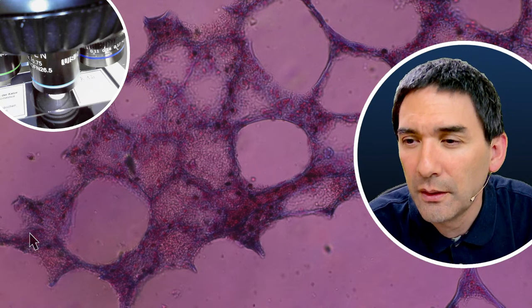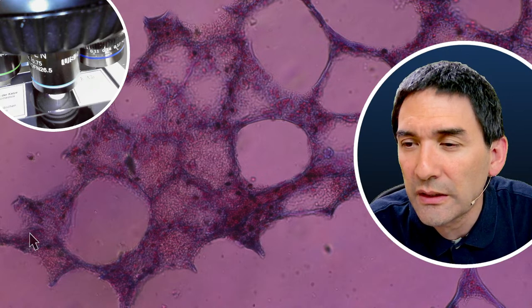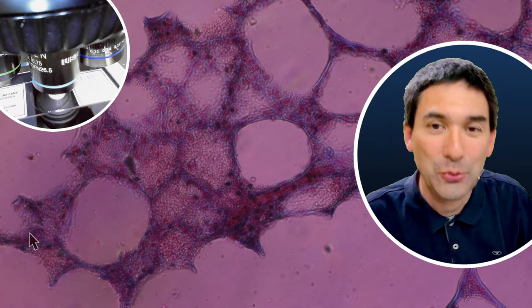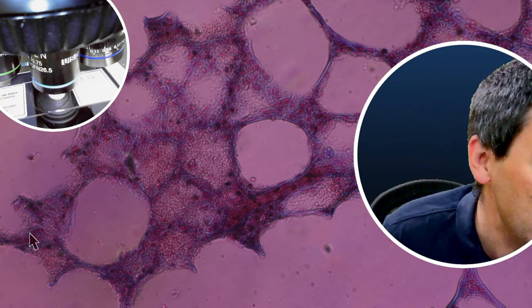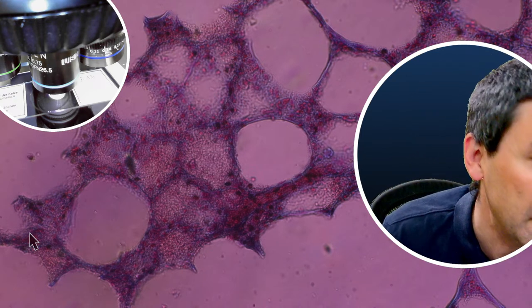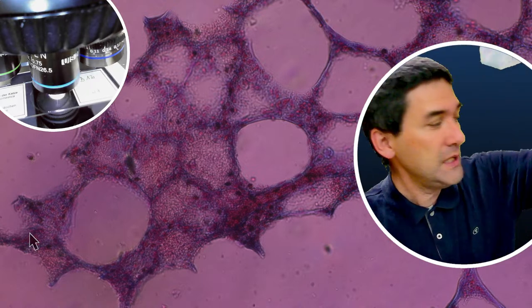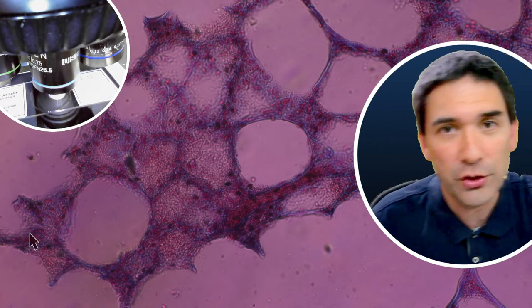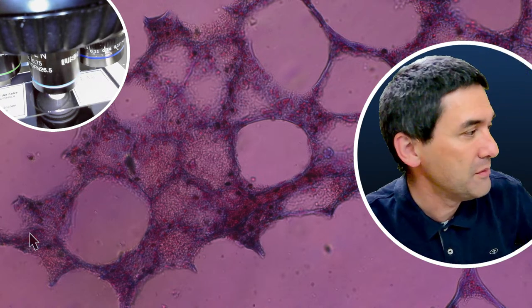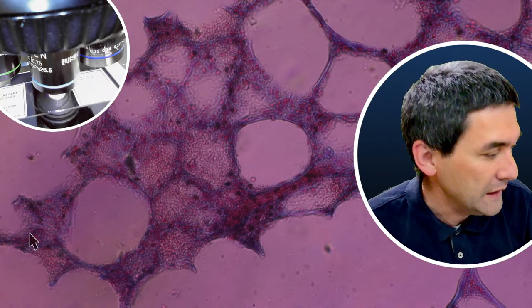Yeah. Do you use a dust cover for your microscope when it's not in use? Do you clean the stage after some time? Oh, embarrassing question for me. Yes, I'm using a dust cover, but I don't put it on every day. Because I keep on using the microscope so often that I sometimes don't put it on. But when I don't use it for several days, I always put it on.